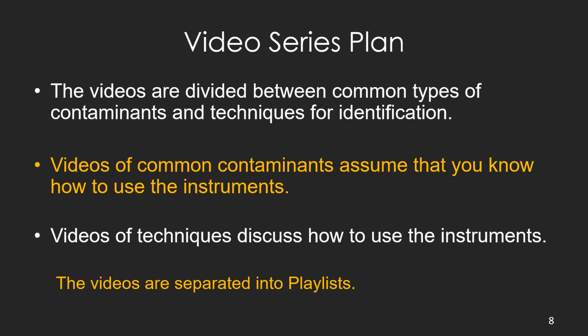How am I conducting these videos? Well, they're divided between common types of contaminants and then techniques for identification. The videos of the common contaminants, showing you how to apply the tests that you would use, say with polarized light microscopy, assume that you know how to use the instrument.